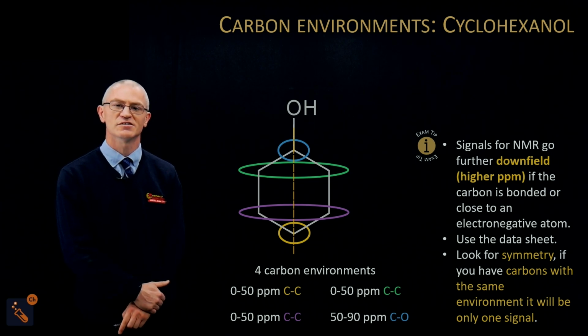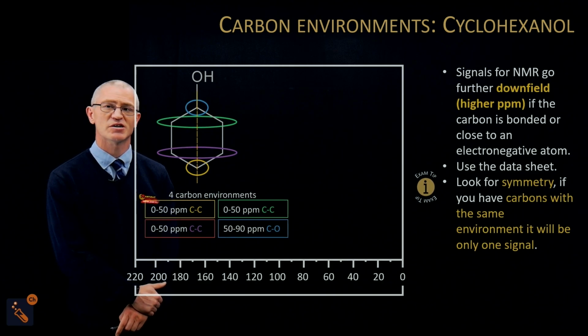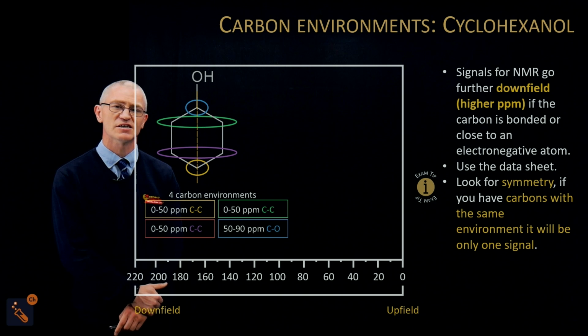We just want you to look at the data sheet again. If that's the case, we can then put it onto a spectrum, and we can look at downfield and upfield again.